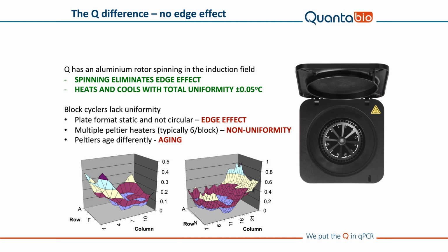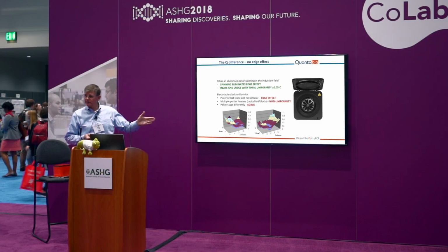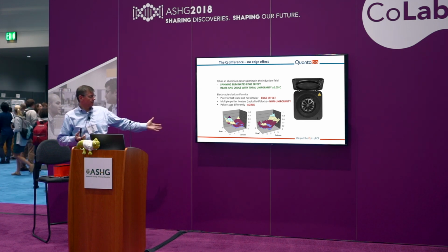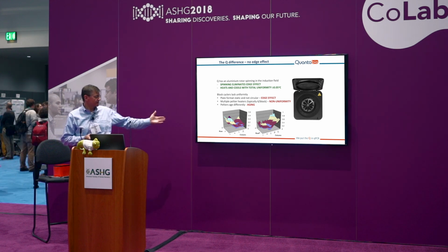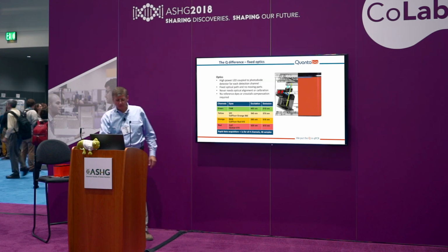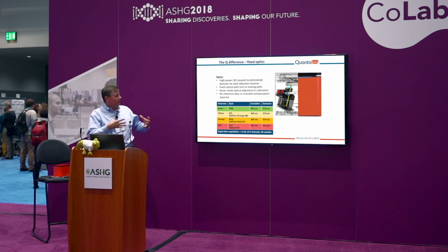Okay. So what I've included on the bottom are actually heat maps that were done on a Peltier-based machine, which is one of the more precise machines designated for high-resolution melting applications. And by putting in basically a DNA probe in every well and then looking at a very fine level melt curve on those, you actually have a site-to-site thermometer in every reaction, and you can see that you have differences on a 96 well block, typically of around 0.3 degrees, quite a range. You see profound edge effects on these. But on this machine, you don't have that.